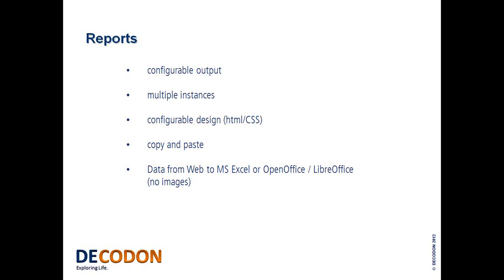And finally, since these reports are web-based, every single report has a unique URL. You can copy this URL and insert it into your spreadsheet calculation software like Excel, OpenOffice, or LibreOffice to have access to the tables that are included in the report automatically and import the tables into your tables in the other application.